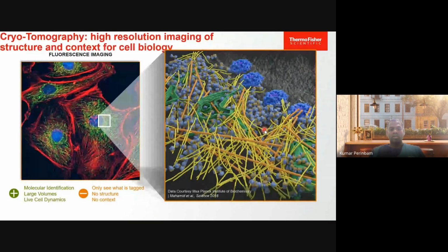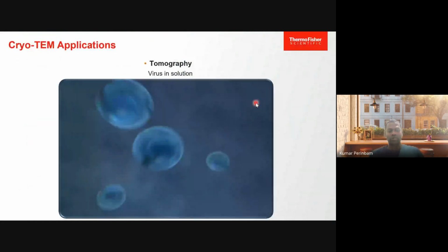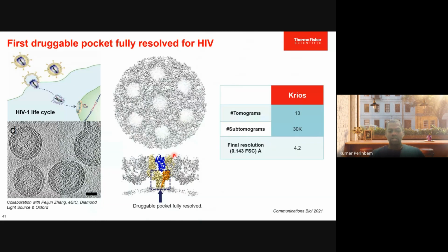If you take cryo-electron tomography, this is the kind of image that you would get. The small blue ones are, I think, ribosomes. I'm not very good at reading this, but other studies would explain it better. So this is how cryotomography works.